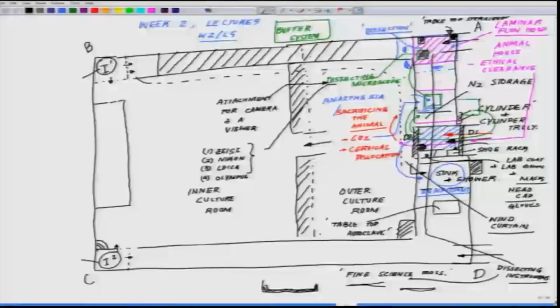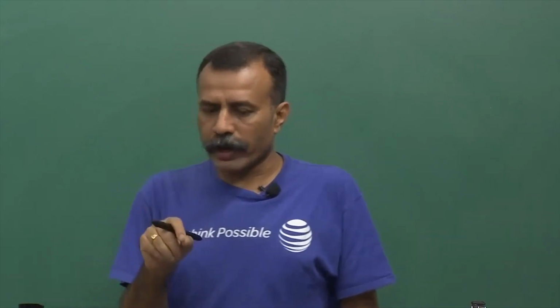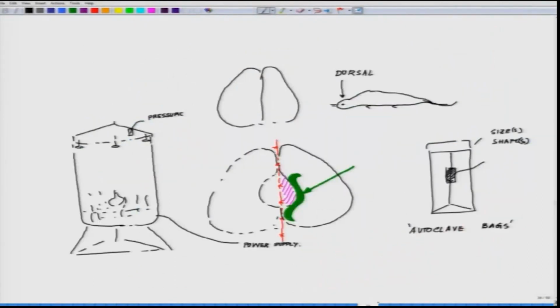So, you get this instrument inside, and while you are dissecting, automatically you may feel like, if I could re-sterilize, because from one animal to the second animal, from one embryo to the next embryo. So, for that you need dry sterilization, which is the tabletop sterilizer. So, these are sterilizers something like this.